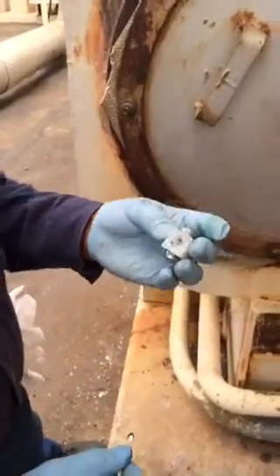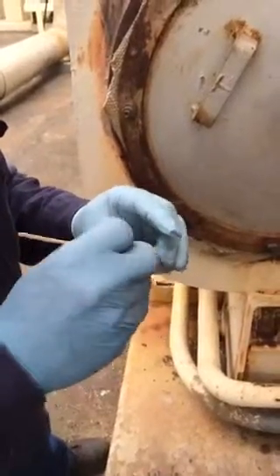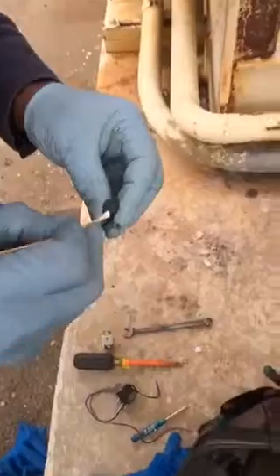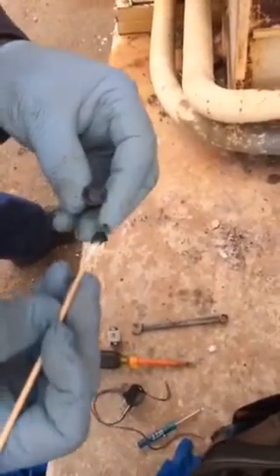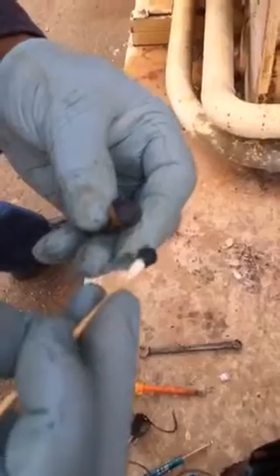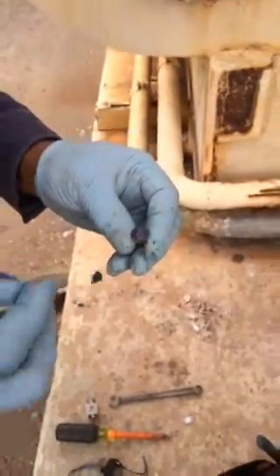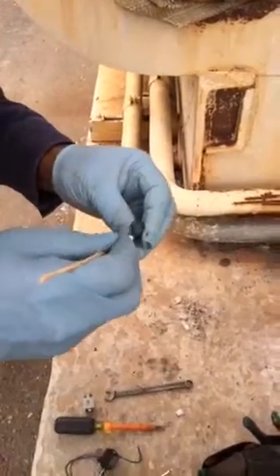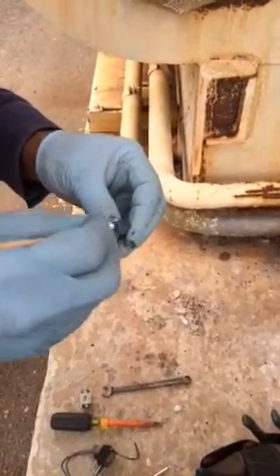These ports are clogged up. See this crap right here — that's getting in and clogging stuff up right there. I'm gonna get a DI bottle and clean all this stuff out.